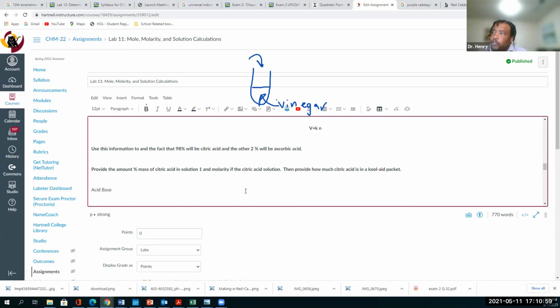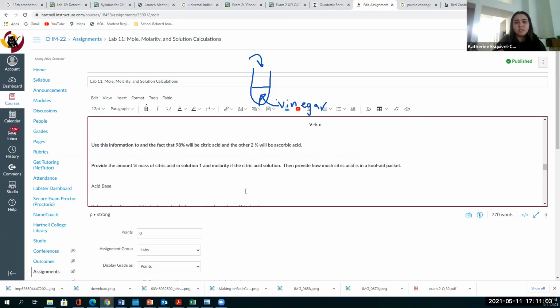Also that. Yeah, 1 or 2 balls of that. And then I don't add the Kool-Aid to it? Nope. Because now you're just comparing, because you know that vinegar is acidic, right? Yep. And you're just confirming that you're not getting BS.